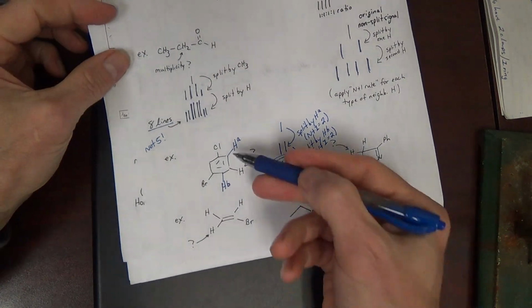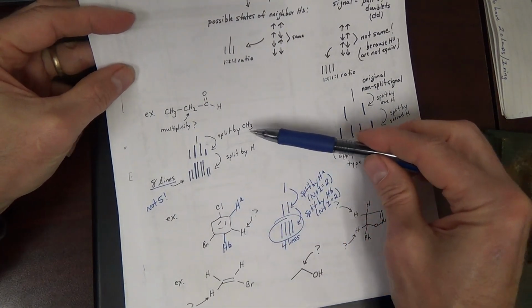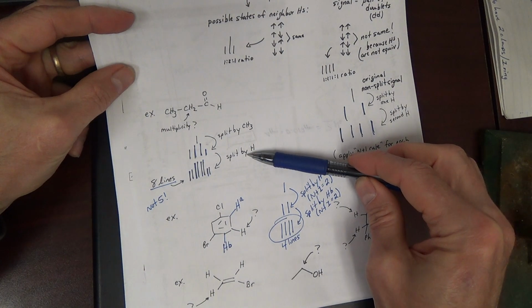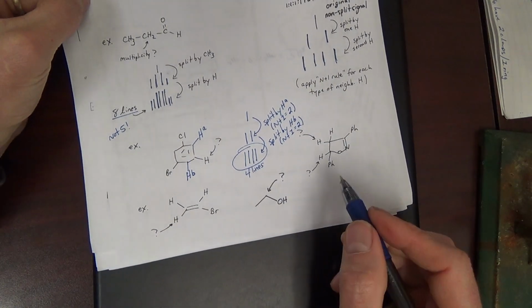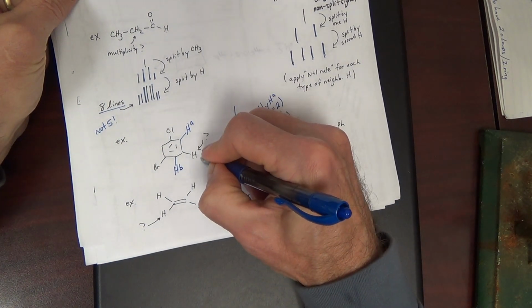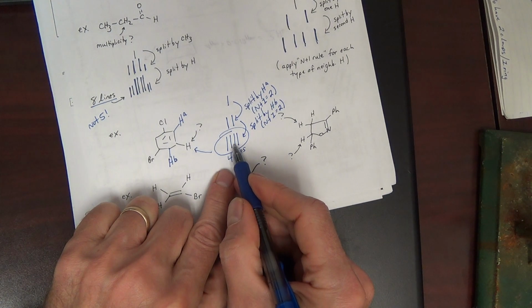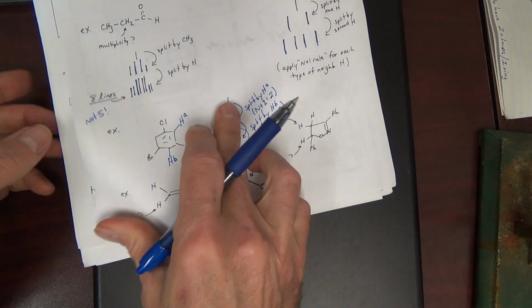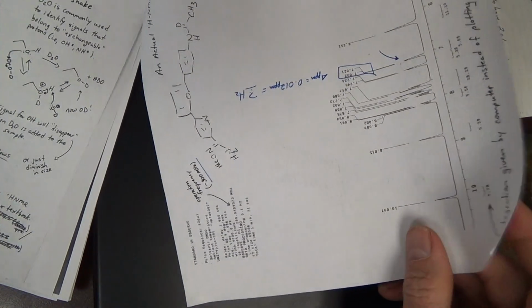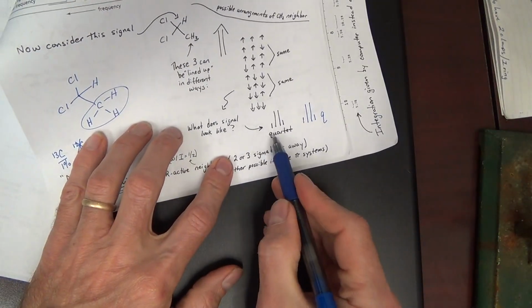Okay, that was a 1 and 1 splitting, where up here we had a 3 and then 1 splitting. 4 lines. Now, importantly, is that a quartet? The answer is no. We don't call that a quartet. A quartet is going to look like this.